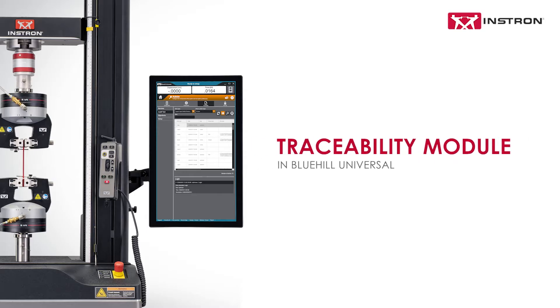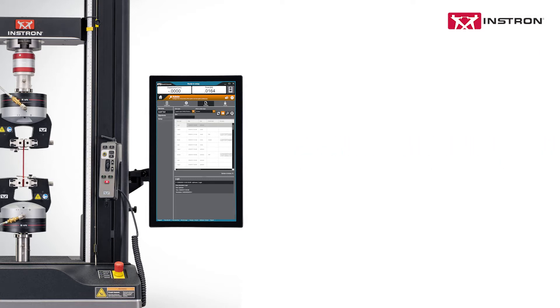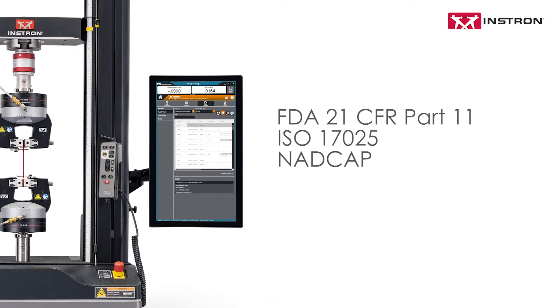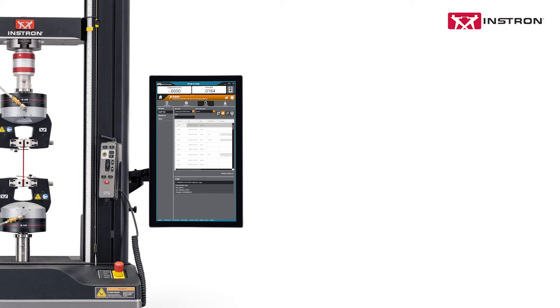Blue Hill Universal's Traceability module enables users to meet the audit requirements associated with FDA 21 CFR Part 11, ISO 17025, NADCAP, and others.